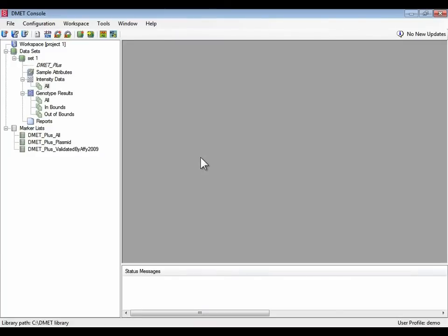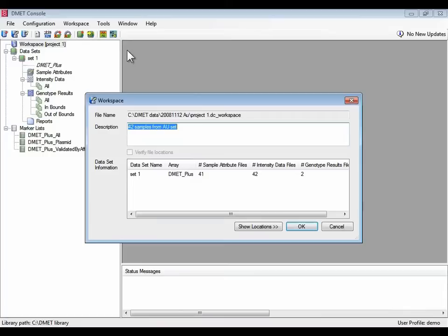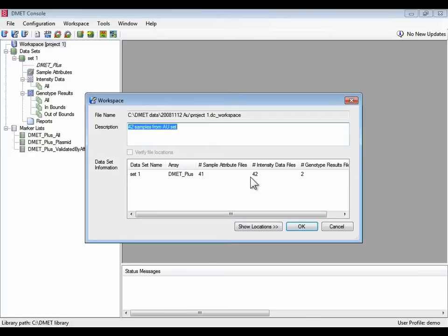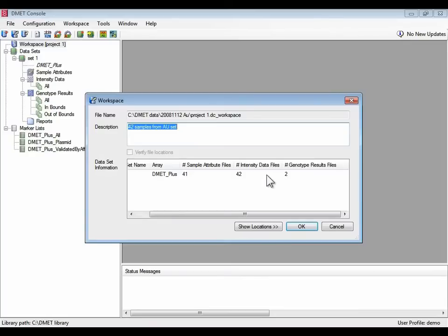First, let's get a picture of what data has and has not been processed. So let's show information on the workspace. There's one data set in this workspace, set one, for which there's 41 sample files, 42 intensity files or cell files, and only two genotype results files.